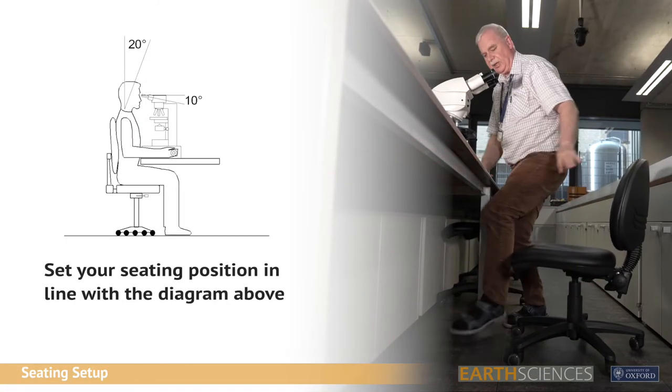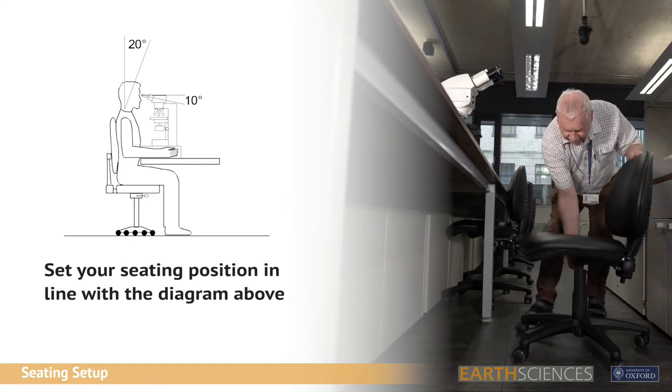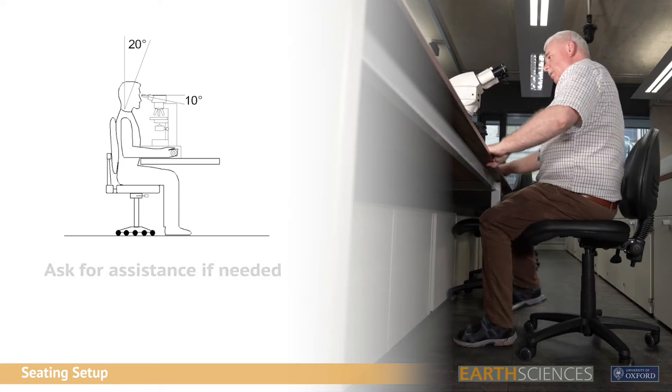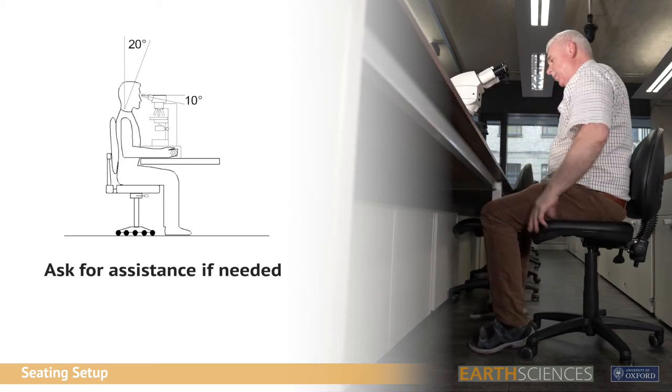Having positioned the microscope on the bench, now is the opportune time to set the chair to the correct position, ensuring that you are comfortable with no strain on your neck or back.